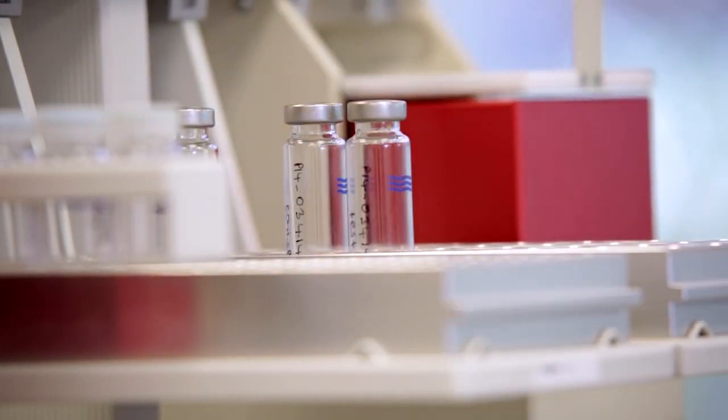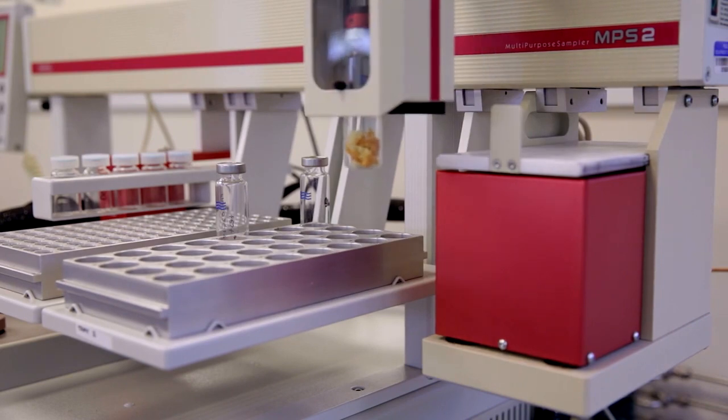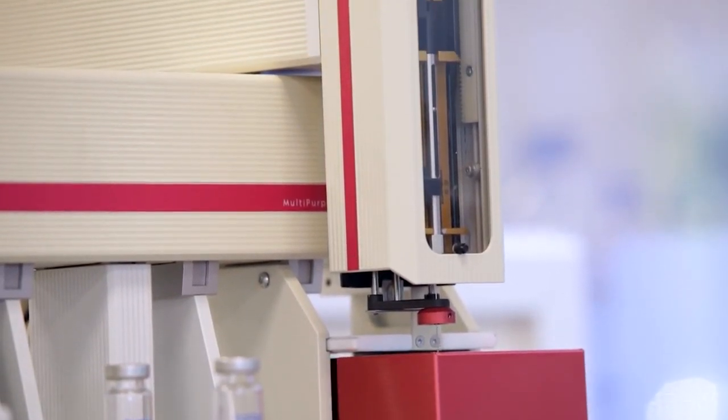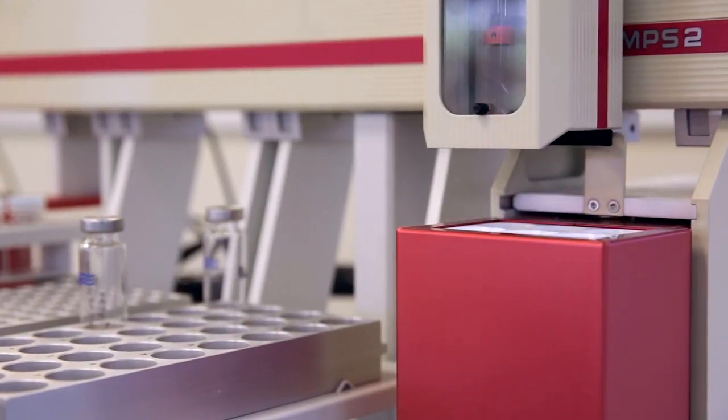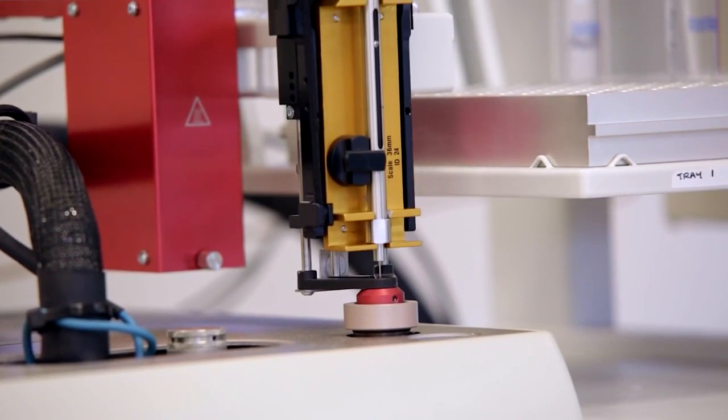Our analysts begin with solid phase microextraction linked to gas chromatography mass spectrometry. This method can detect halogenated phenols if present at a high enough level. However, in this case, a more thorough extraction technique is needed.